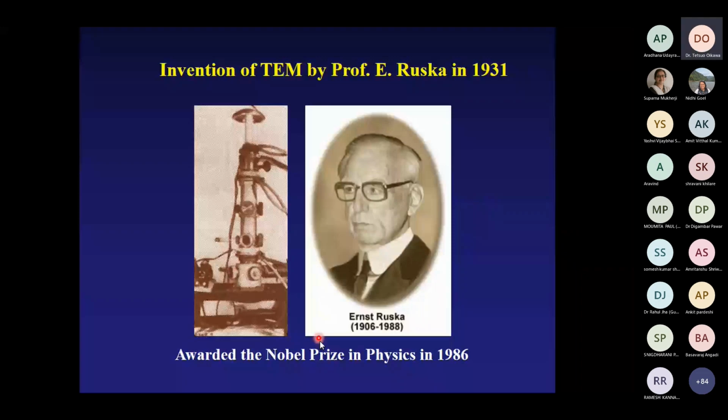Owing to this contribution, the Nobel Prize was given in 1986. So the transmission microscope is now a very important tool in both material science and biological life science fields.